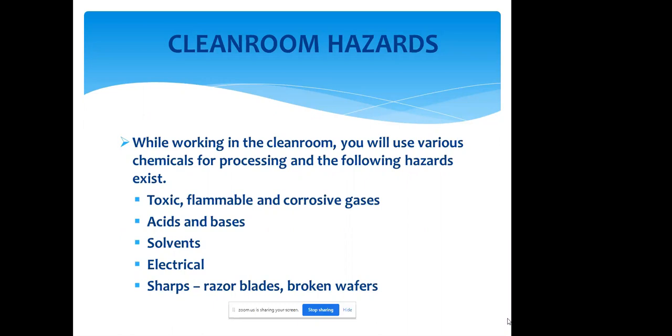Be aware of your surroundings. That's the most important thing you need to take away from this slide. Be aware of your surroundings. If something is buzzing, you don't know what it is, call your manager, call your technician if there's a technician in your clean room. Call your professor if your professor is not around. Let them know there's something buzzing. Maybe it wasn't buzzing when you got in there, and all of a sudden you hear the noise. You have to pay attention.